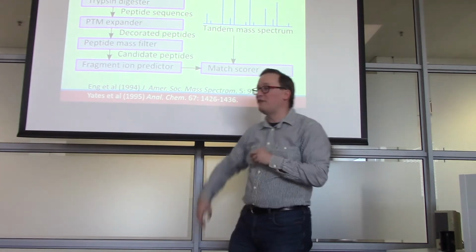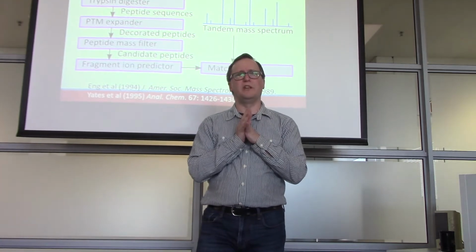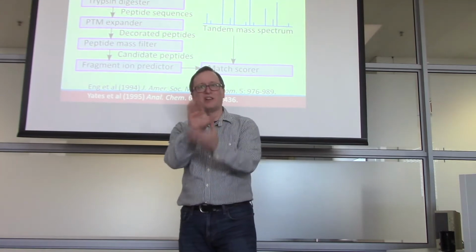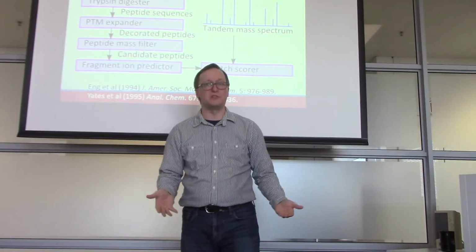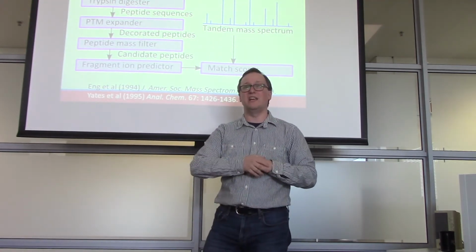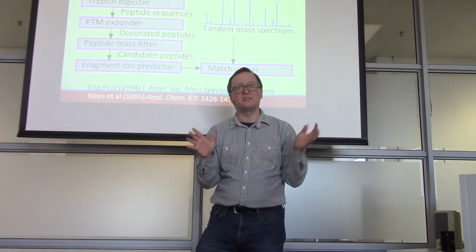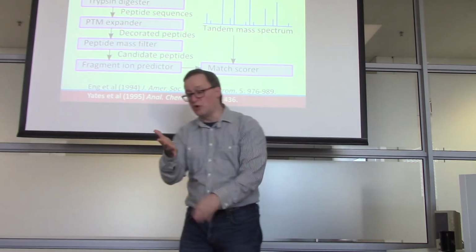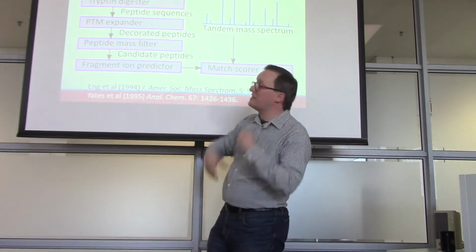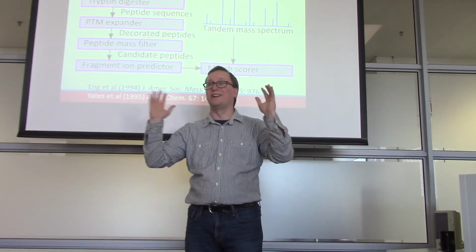So we start with a FASTA sequence database. FASTA is an old sequence alignment algorithm, but one of its greatest gifts to the field of bioinformatics was a very standard text file format for reporting bunches and bunches of protein and nucleotide sequences. So we start with a FASTA database that contains all of the protein sequences known for this particular species. Where can you get these? Anywhere. You can get them from Ensembl, from UniProt, from RefSeq, lots and lots of places. So getting a FASTA sequence database is effectively giving us the universe of all sequences we're going to consider.